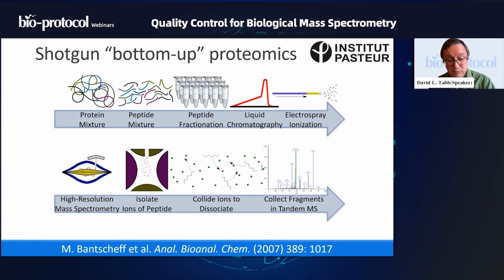And of course, there are plenty of people who don't understand how the data produced by a tandem mass spectrometer become identifications or become quantities. So I thought it would be worth talking a little bit about the first 2 aspects of that. I do a lot of talks about how to identify tandem mass spectra. I'm not going to repeat that material here, but I hope that at least by visiting the first 2 things, we can start thinking about where variability enters into shotgun proteomics.